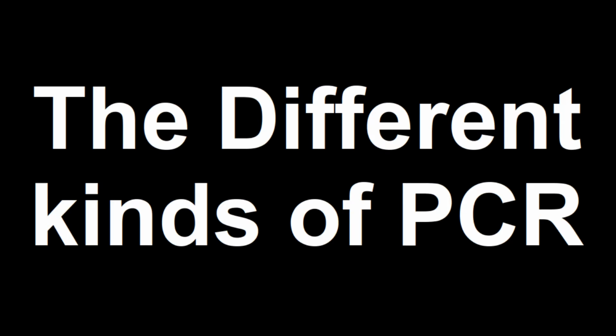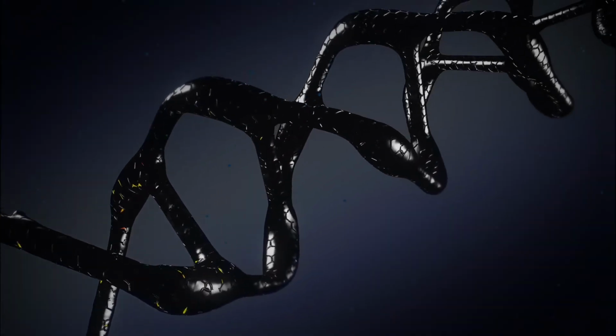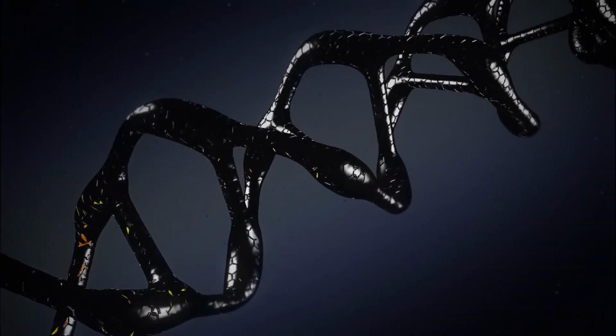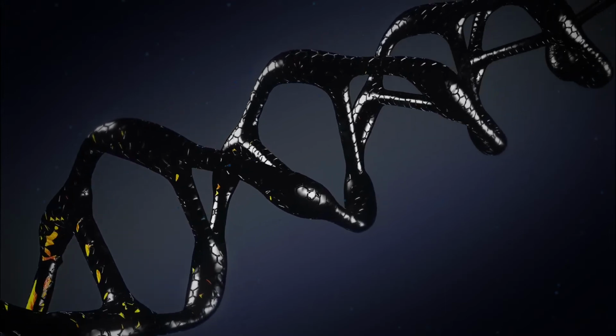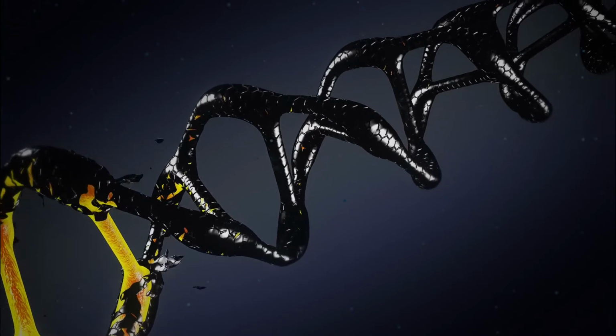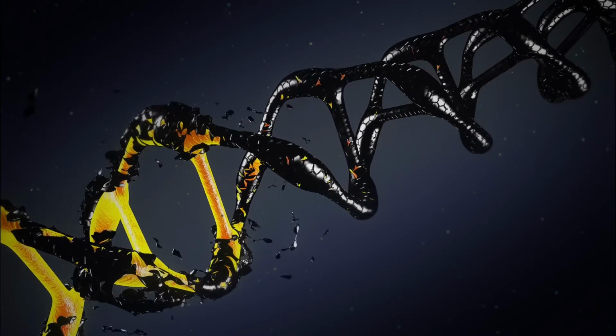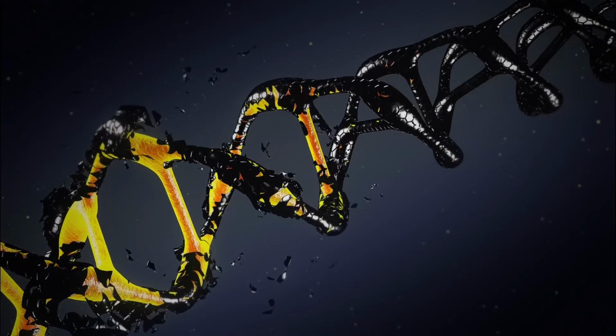Hello and welcome to this video on PCR types and what they do. PCR, or polymerase chain reaction, is a genetic test that measures how much of a given single gene is being expressed in a tissue, cell, or similar small sample. It can be extremely accurate, efficient, and powerful, or a blunt tool that keeps working despite hiccups.